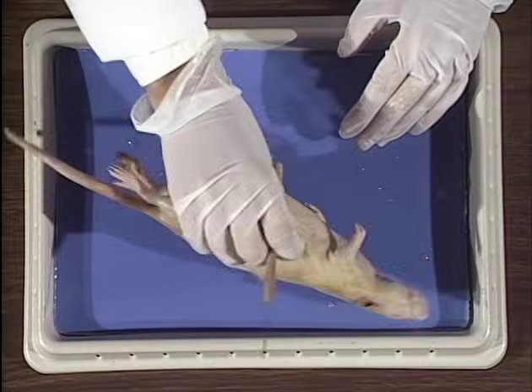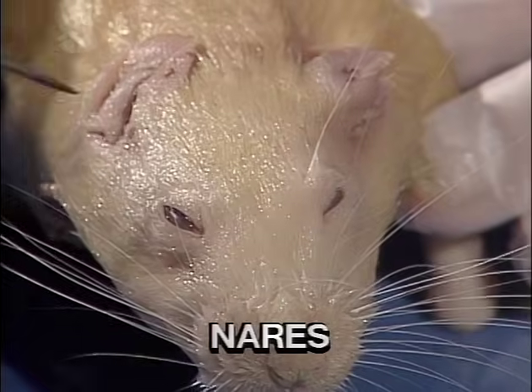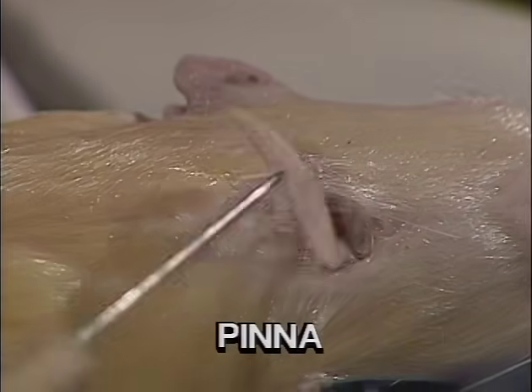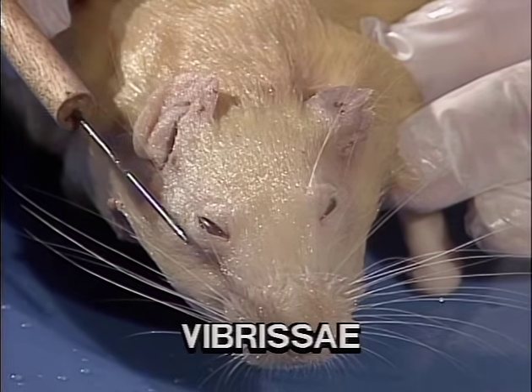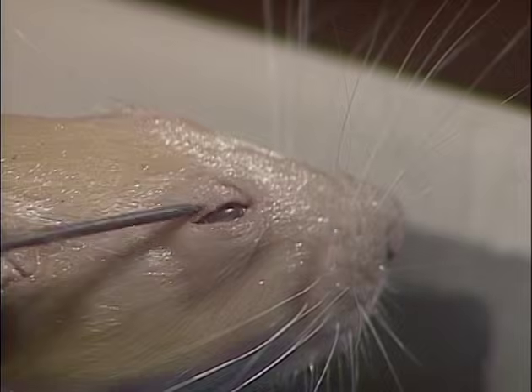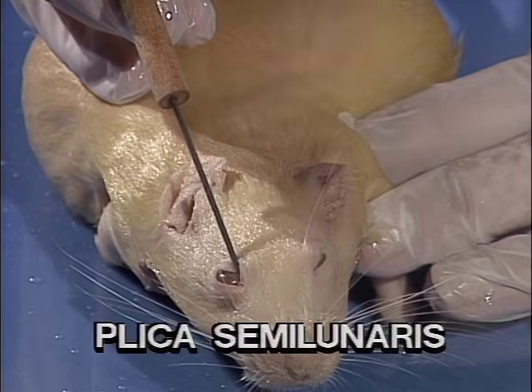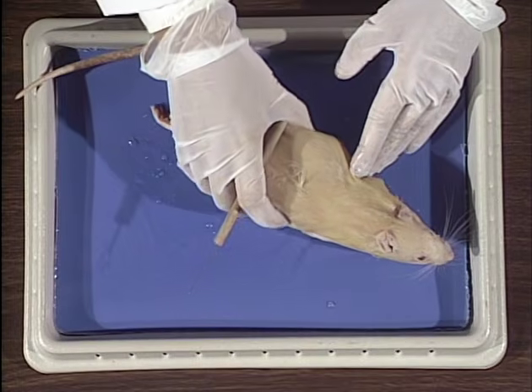On the dorsal side of the head, we see the external nares, and the opening to the ear, which is surrounded by the pinna. The function of the pinna is to channel the sound waves into the ear. The long whiskers that extend out from the side of the head are known as vibrissae. They are sensitive to touch. The eyes are protected by an upper eyelid and a lower eyelid. In the medial corner, we can see the remnant of the nictitating membrane known as the plica semilunaris. It helps in keeping the eye clean.